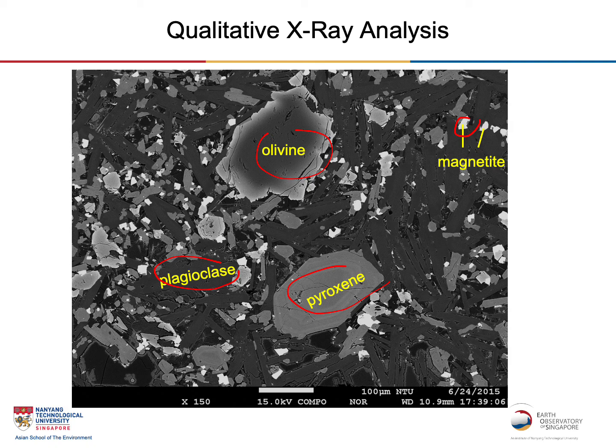We don't see the color, and we don't see the extinction angle like in optical microscopy. In SEM, and I maybe forgot to tell this, the image is mostly black and white. So you have only black and white and brightness to tell you what the mineral is. This is where the qualitative X-ray from EDS excels.